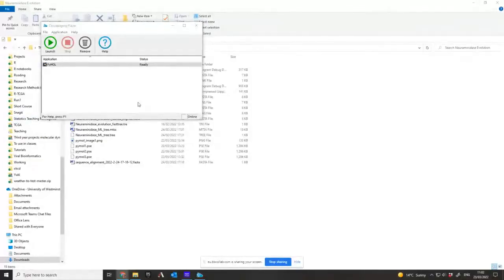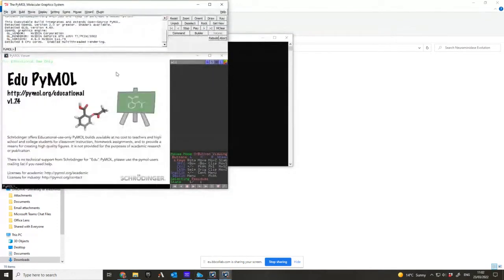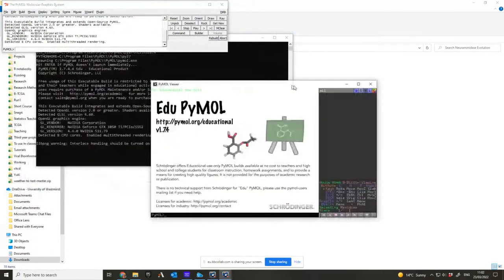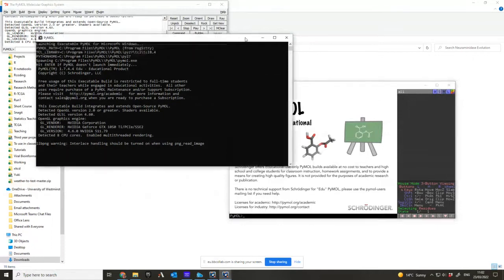So to visualize protein structures, there's a program that you can get out of Apps Anywhere called PyMol. So I'm going to start PyMol. And PyMol starts with a collection of different windows. There's going to be one that allows you to actually display the protein. There's going to be another one which tells you all sorts of console information and text.